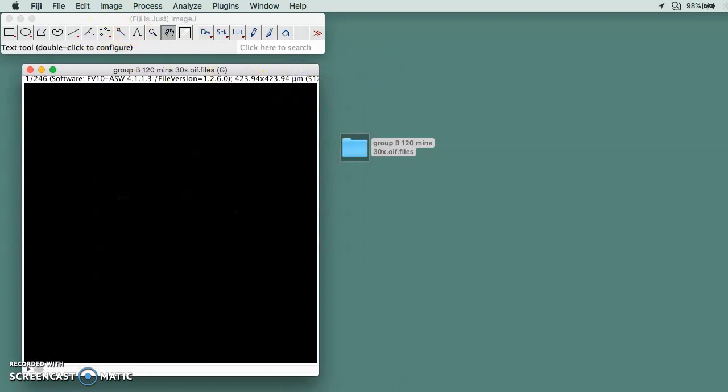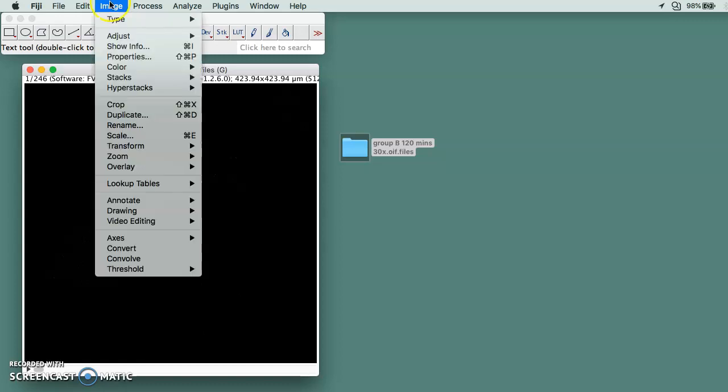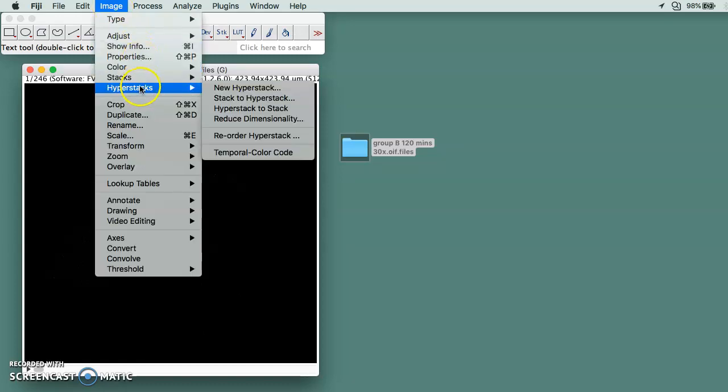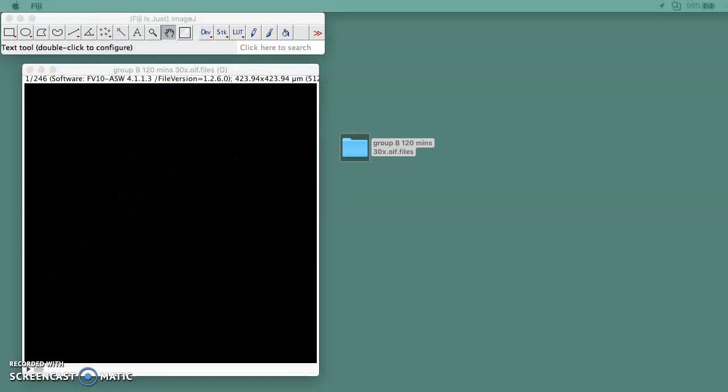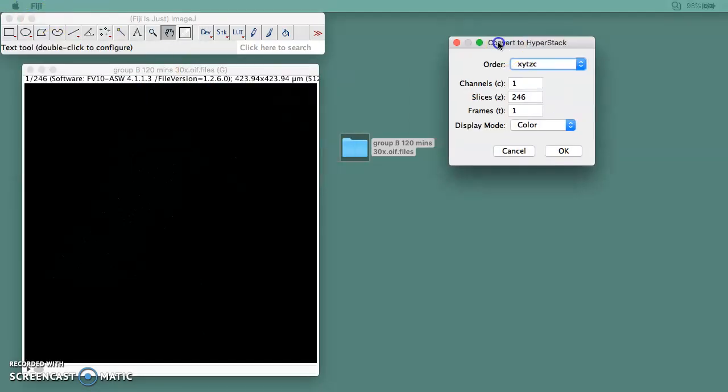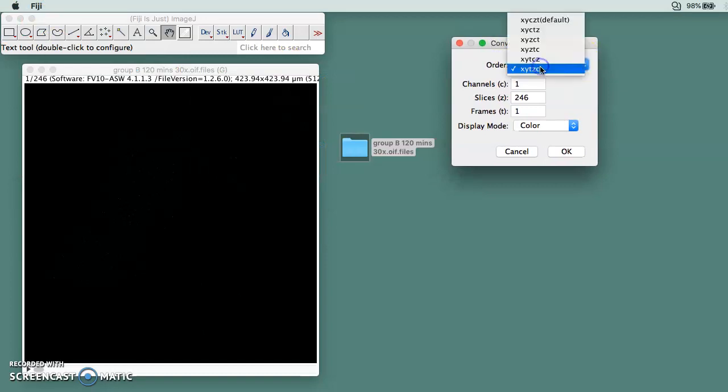Once it's opened, the first thing you need to do is go to Image, go to Hyperstack, and then do Stack to Hyperstack. This window is going to jump out and the order needs to be the last one, XYTZC.